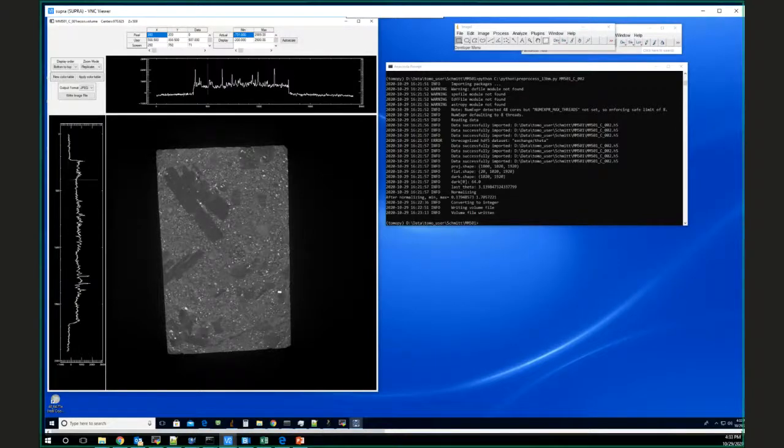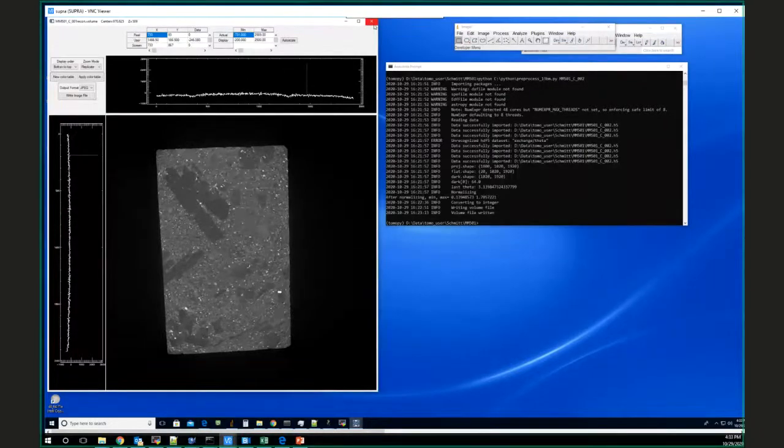And these here, Doug, do you have any idea what these are? They're like lath shaped. Yeah, crystals. No, I think it's something that's crystallized out. I don't actually know. Okay. When I first saw them, I kind of thought maybe they're biotite, because it's platy, but that's not right because biotite would have iron in it. It'd be more absorbing than the matrix, probably. So I don't know if it's some kind of... I'm just guessing plagioclase or something. Yeah, it could be a plage. I mean, there are lath-shaped plages. Right? Yeah.